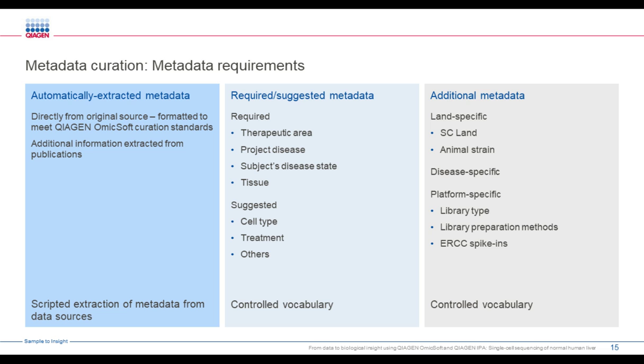In addition to the automatic and manually extracted key metadata, there is also additional project-specific metadata that can be included in each of these single-cell projects. Animal strain, Land-specific disease-specific information depending on the specific therapeutic area that could be analyzed, and any platform-specific information that would be relevant to the biologist in interpreting these, such as the library preparation and the presence, for instance, of ERCC spike-ins for normalization.